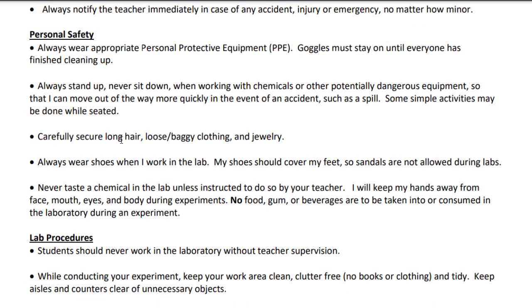In addition, you don't want your hair or your clothes touching or getting into either fire or the chemicals themselves. So always make sure that long hair gets tied back, and all the loose and baggy clothing, we just don't wear that during a lab day. Okay? Always wearing shoes. That means that you can't wear sandals. No sandals allowed. Now it's wintertime, but we are Canadian, and some of you guys like to wear your Birkenstocks and socks.